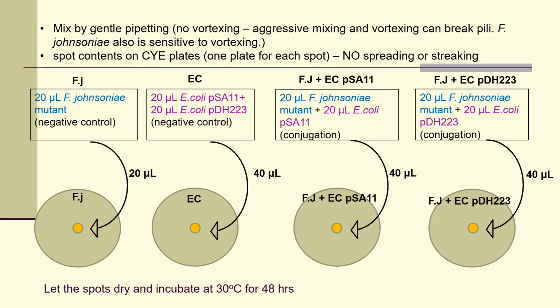We will place these volumes in the center of the plate. This way, the cells will be in close proximity and will allow maximum contact. Then we will let these spots dry and then incubate at 30 degrees for 48 hours.